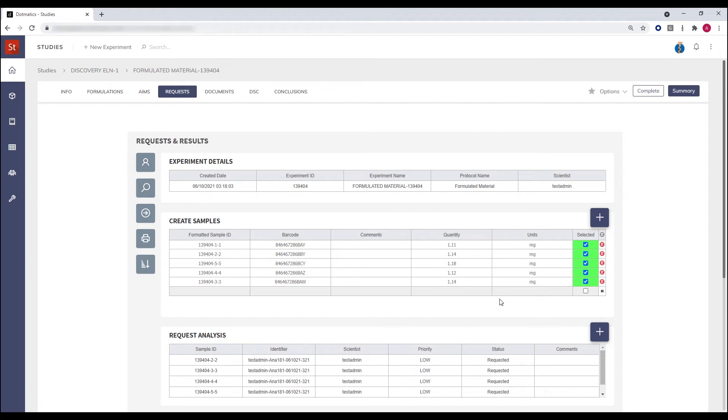Once the analysis has been performed, the end user has the ability to gather that information and store it back into their ELN.